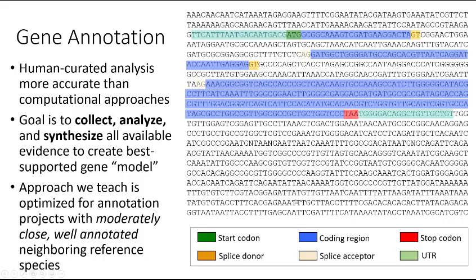And I just want to highlight that there are other parts of a gene that we've talked about, such as the untranslated regions shown in teal here. And we will not be trying to locate the untranslated regions in this particular project. So we will really only be looking for where the protein coding sequence lies within a gene.